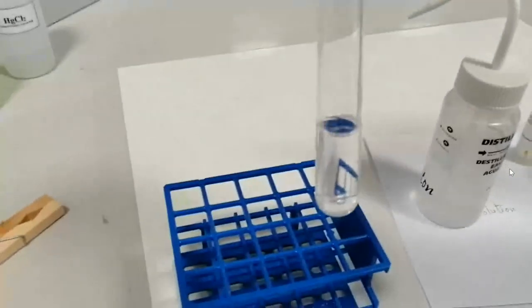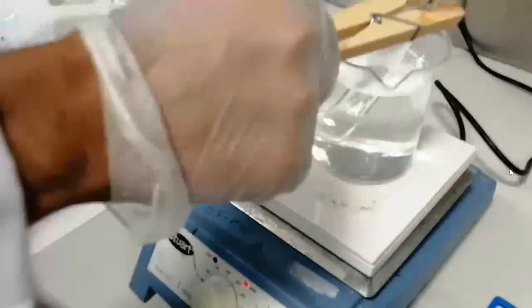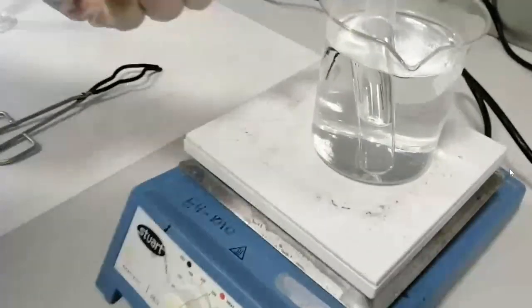Now we are going to heat in a water bath. Just hold the test tube and transfer it from the test tube holder to the water bath.